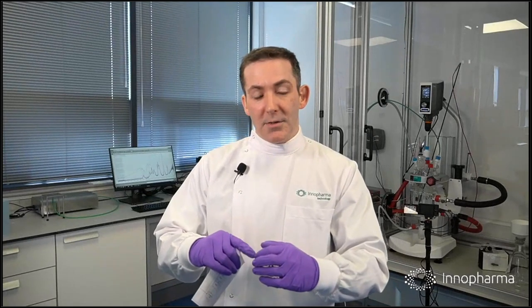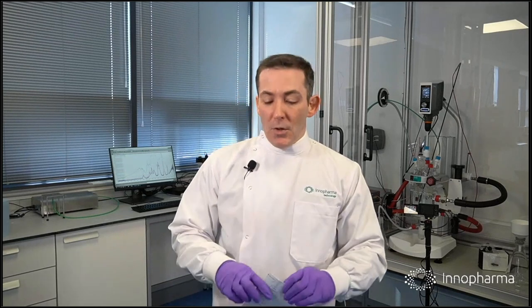Yeah, absolutely. And for exactly the same reasons, monitoring blend uniformity or content uniformity, which is where we analyze the distribution of an active pharmaceutical ingredient within a tablet. We're interested in mixing until it's well mixed, until it's homogeneous. And obviously, if the signal changes in response to changes in the concentration of what's present, when the changes slow down and when it stops changing, it means our mixture is well blended. Okay, so the trend there is more important than the final values.